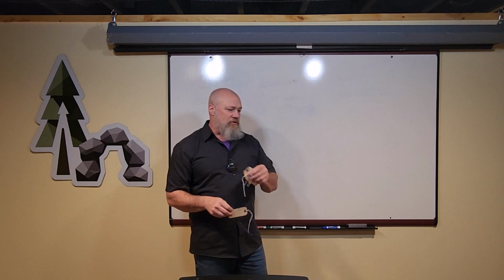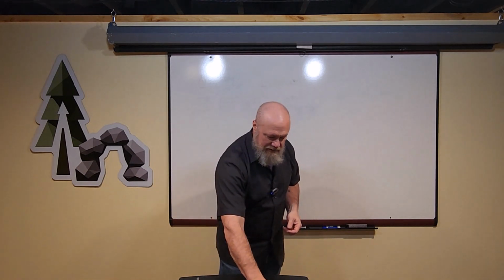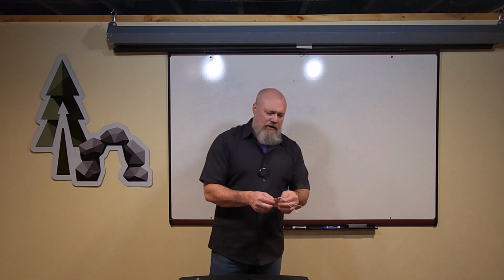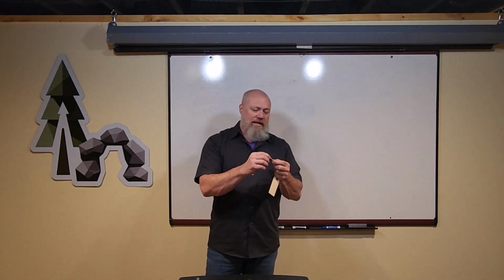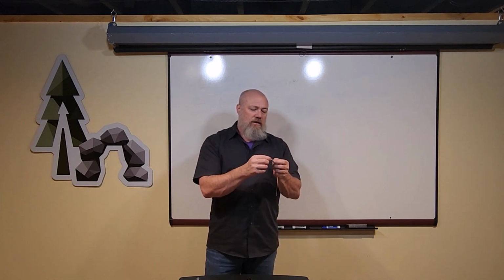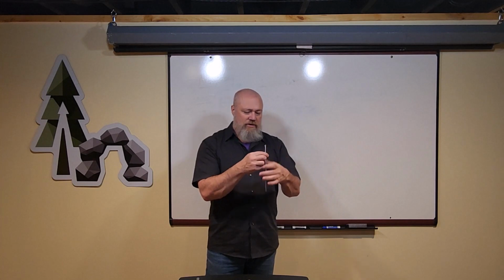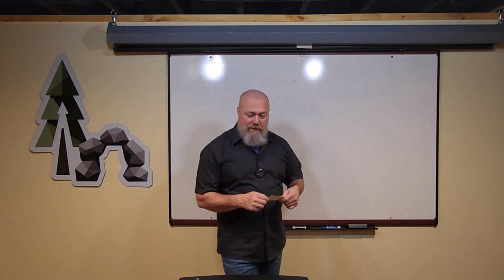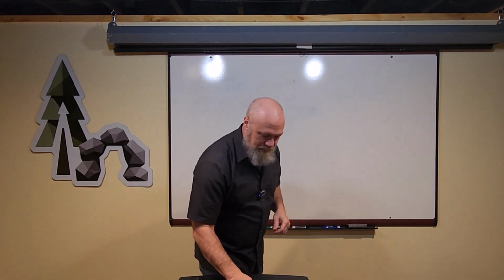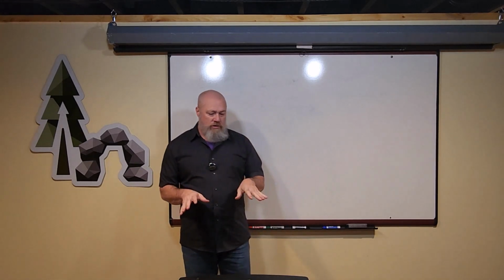And as you're dissecting out the structures, if you attach tags as we go and use them for study aids, I think that'll be super handy. And as far as attaching them goes, tying a double overhand knot or maybe just a quick lark's head and then attaching them, square knots, surgeon knot, lots of ways to attach them to the structures without damaging the structures. And if you want to know knots, check out the knot playlist. All right, so then I'll probably talk to you about lots of different knots. So those are the tools you're going to use.